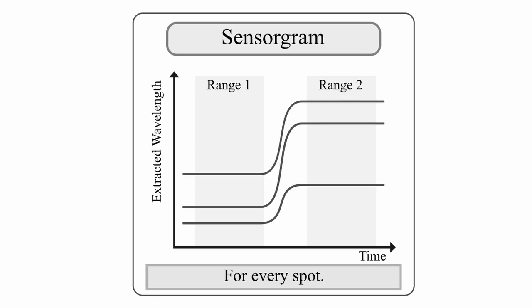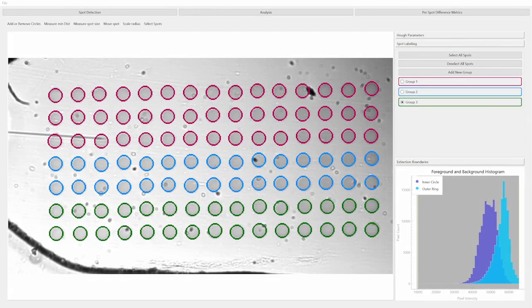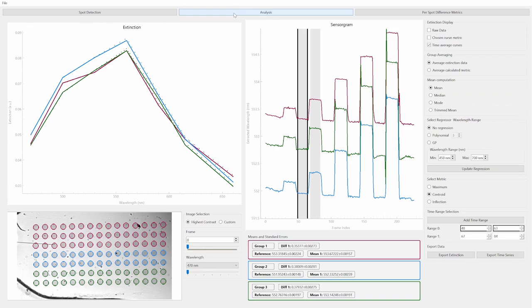Traditionally, domain experts perform much of this analysis manually, often using custom scripts. This process can be time-consuming and makes it difficult to experiment with different parameters. Our framework integrates the entire analysis pipeline, automating key steps while giving users full control over configurable parameters. This flexibility is essential, as many analysis choices remain underexplored.